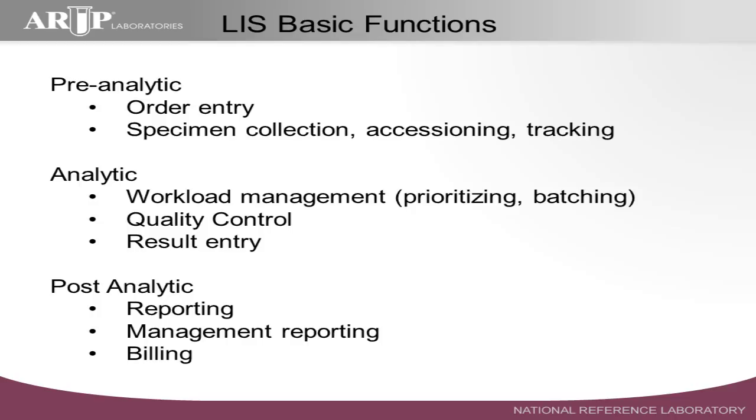So to get to the basic functions of a LIS, the functions of any software system basically tell you what the purpose of the system is all about. And I like to break it up into 3 categories, and I think that's what your chapter in LIS did too. The author broke it up into 3 categories: pre-analytic, analytic, and post-analytic. So what do you do in those 3 areas with an information system to capture the data flow through a laboratory? And that's the challenge.